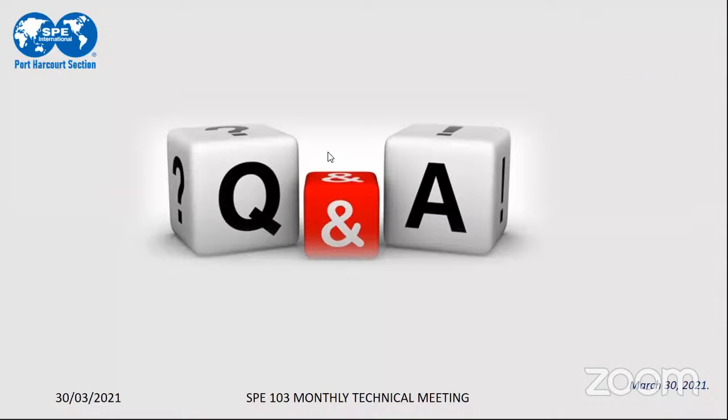The next question, question 2. Are there other techniques that can be used with fingerprinting to improve accuracy, as it is not foolproof as a standalone? Other techniques besides or in addition? Yeah, in addition, to improve the accuracy. It's just to make sure that in the course of our analysis we put in all of the QA/QCs. I can't think of any other technique that can be added on for now to GC fingerprinting. So for now, except you talk about the employment of software, that can be done to improve the process.